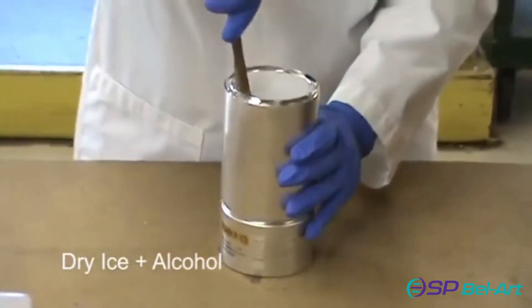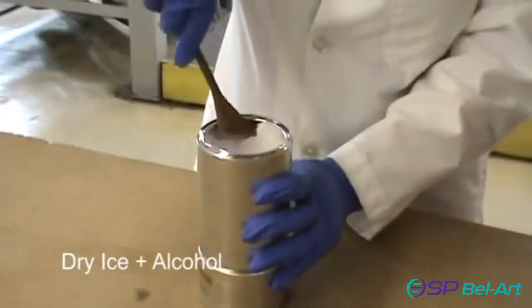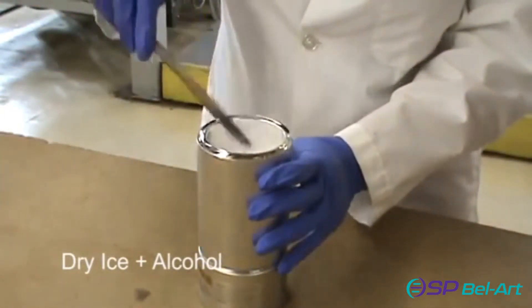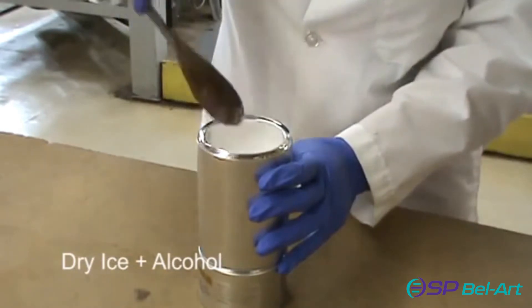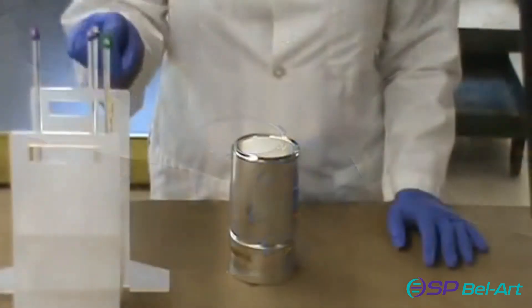If you do not have access to dry ice, you may also use a solution of shaved ice and salt. But please note, the solution can only be used for thermometers with ranges above freezing, as the solution will only reach temperatures slightly below freezing.